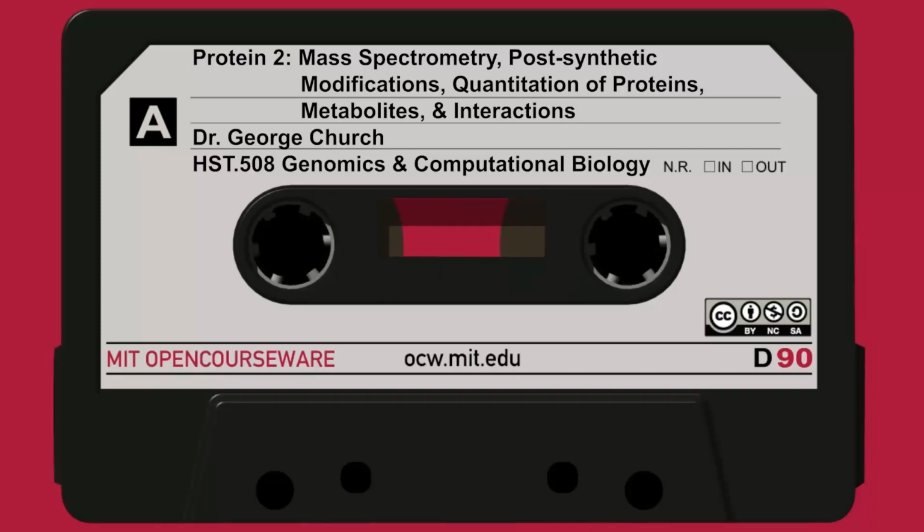The 2 requirements for quantitation are that you have reproducibility and that you have a way of calibrating or calculating. If you can calculate from first principles, then you don't need calibration. If you can't, if it's too empirical, then you need calibration. But you do not need every disparate object to behave exactly the same way. Every peptide does not have to give the same quantitative answer. It simply has to be reproducible and calibratable with that same peptide.